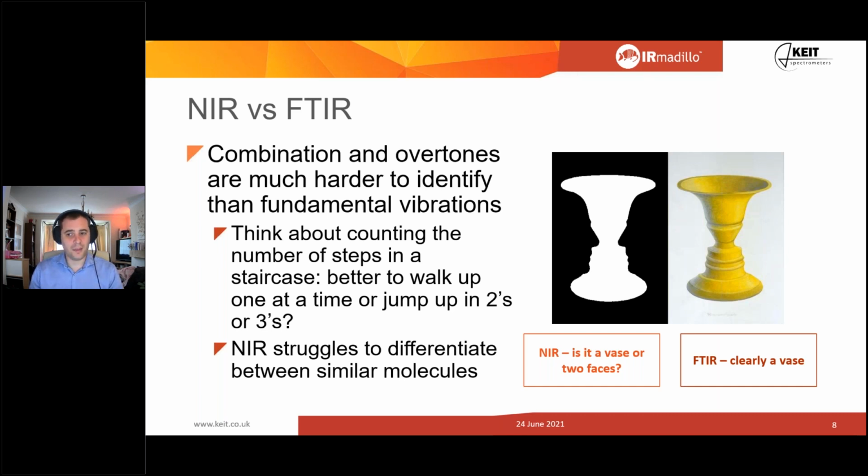So in the edible oils and the fats and oils and grease sector, an example, palmitic, stearic, oleic, those acids, FTIR can pull the difference apart because it can look at the ratio of carbon to hydrogen bonds to carbon-carbon bonds. And that changes as the acid chain length changes. NIR would probably struggle to separate those out because they're too similar.